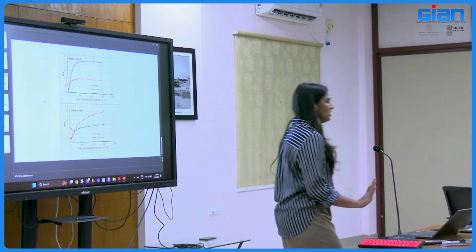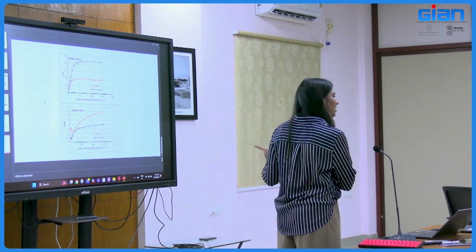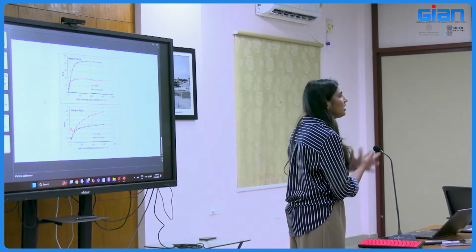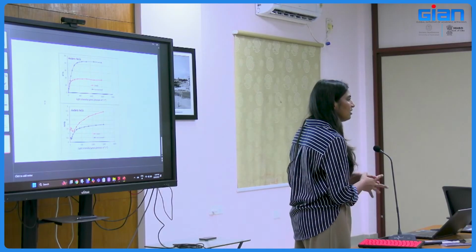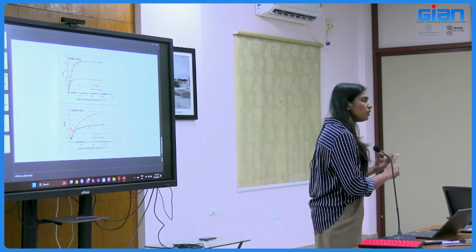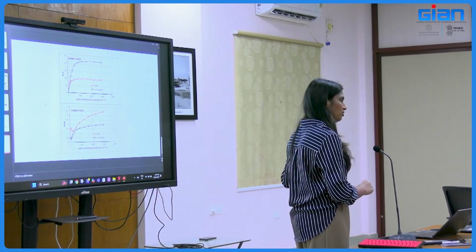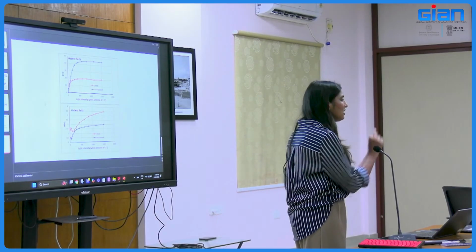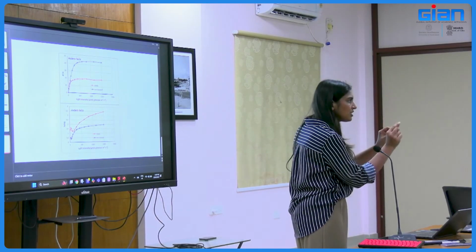The principle is basically fluorescence. The fluorescent signal they can detect, but here they can process it in a more advanced way so that we are getting more accurate and more parameters. You get the same F0, FM, everything here also. As I said, even in this frequency, very minute changes also are detected.